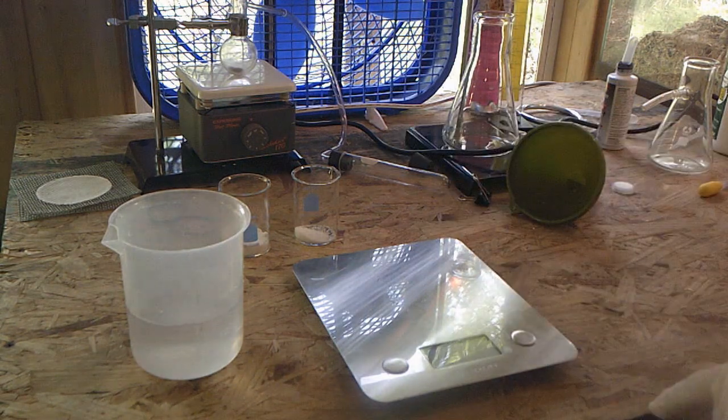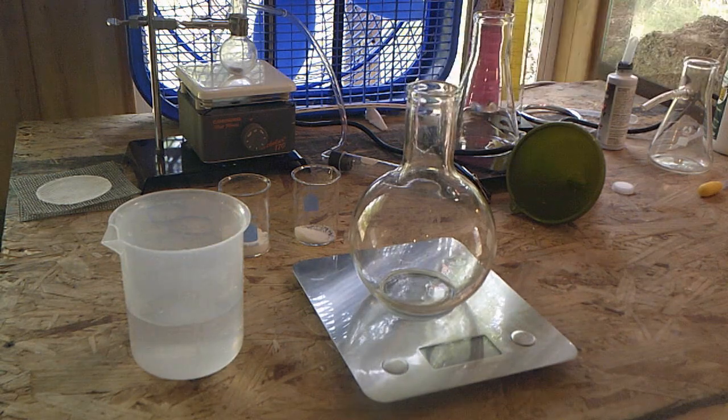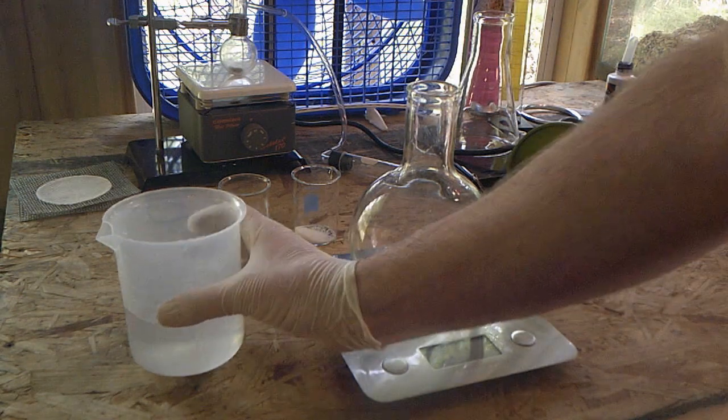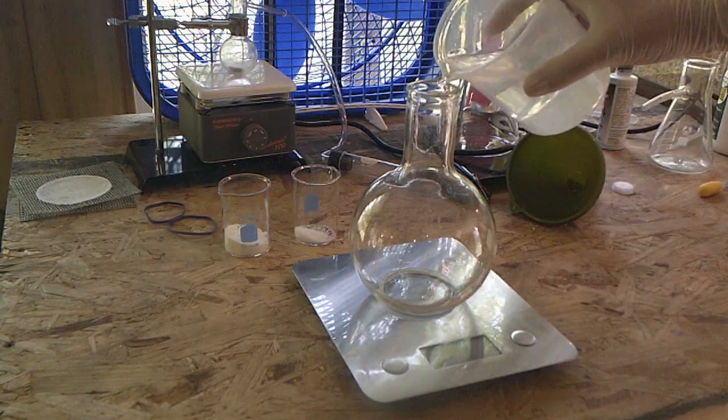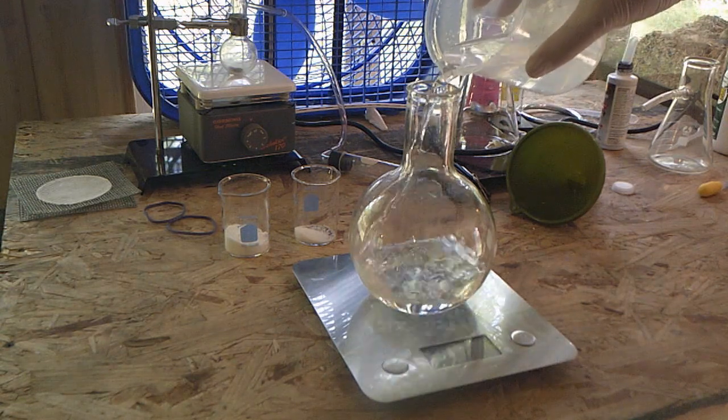So there's our water. Here's our mixing vessel. And let's start off by pouring the water into our reaction vessel. This is called a round bottom flask or a boiling flask.